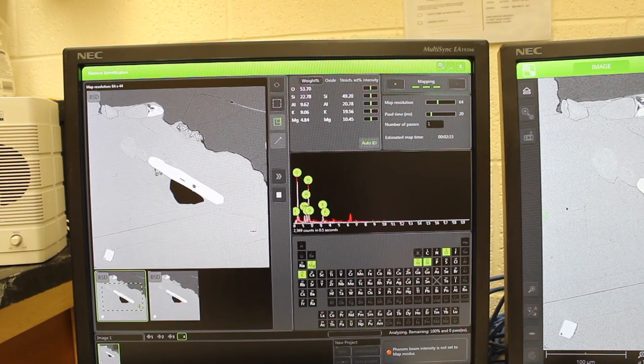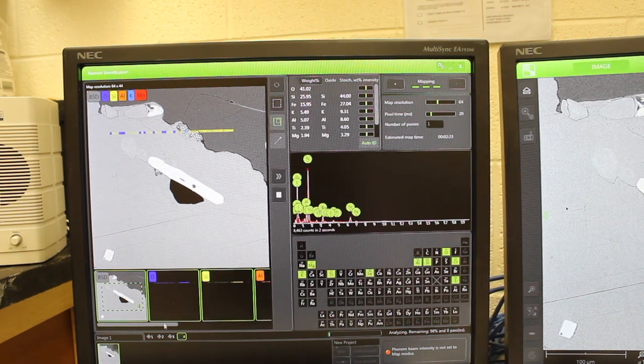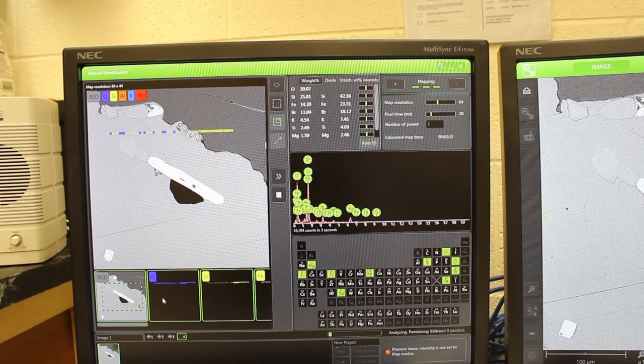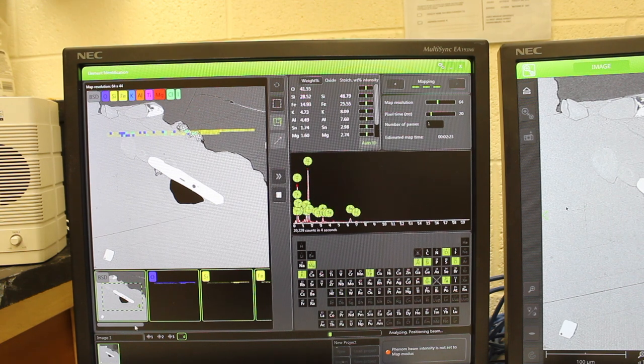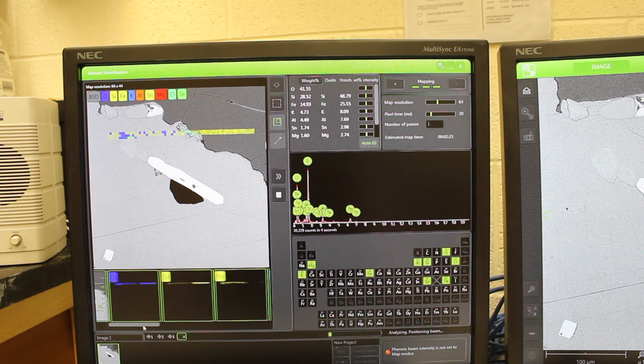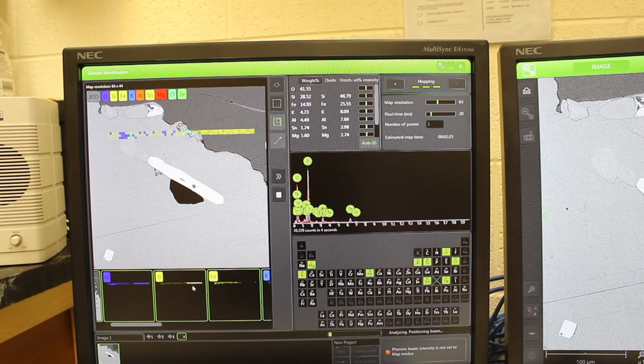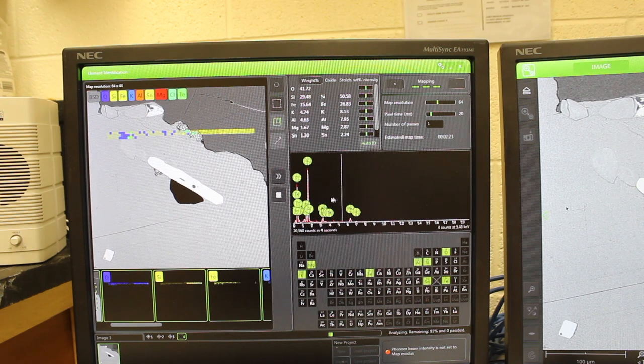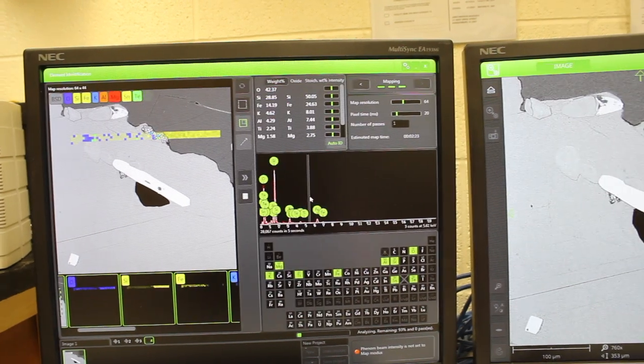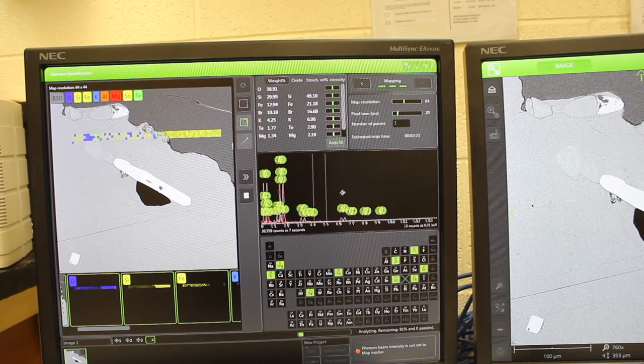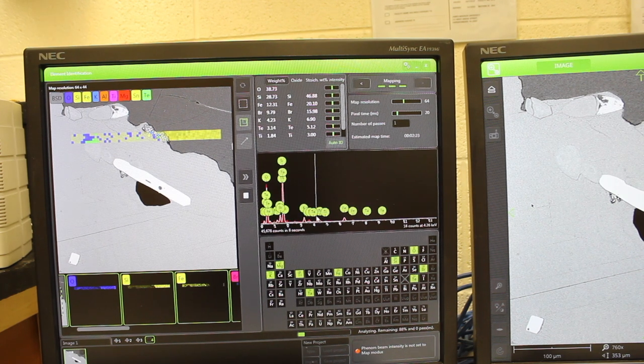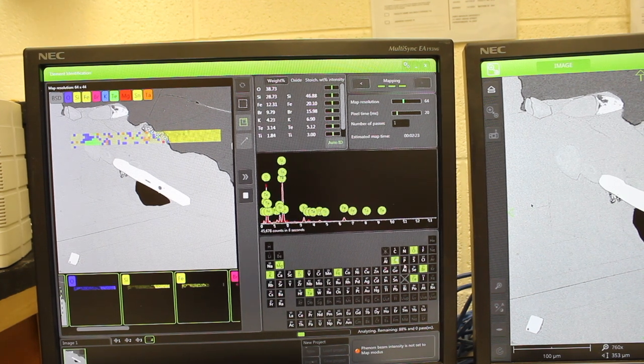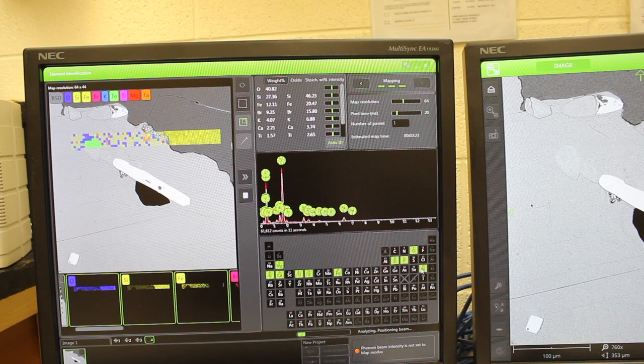The software will bring up these images down at the bottom here as it's analyzing for different elements, and it also has the EDS spectrum here, which you can zoom in again. Just like the point analyses, say I don't want tellurium.